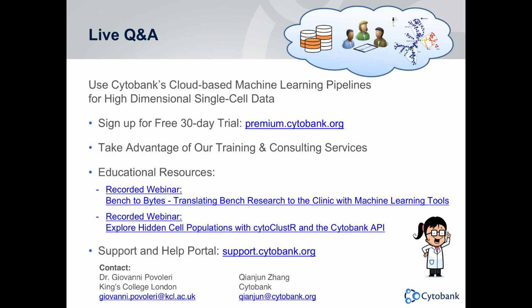Yeah, thanks, Dr. Shahram. Batch effect is important before the t-SNE run, so make sure your data is well quality controlled, as Dr. Shahram just mentioned, for any downstream analysis.